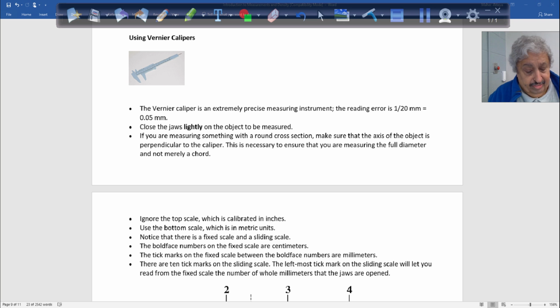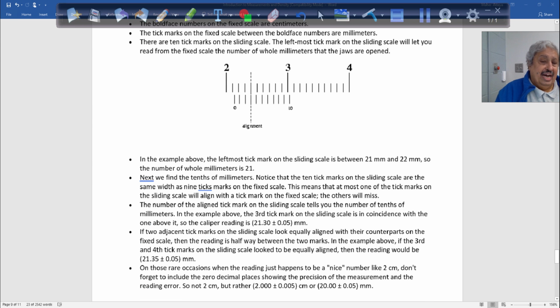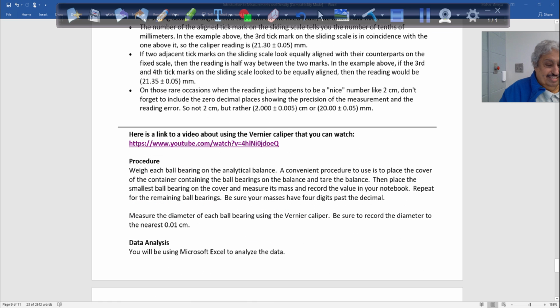I don't know the mass or the diameter. We are measuring the diameter, so for the radius cubed, the diameter is twice the radius, correct? So here it is. The explanation is not really very well explained, but I hope it will play within the video here.